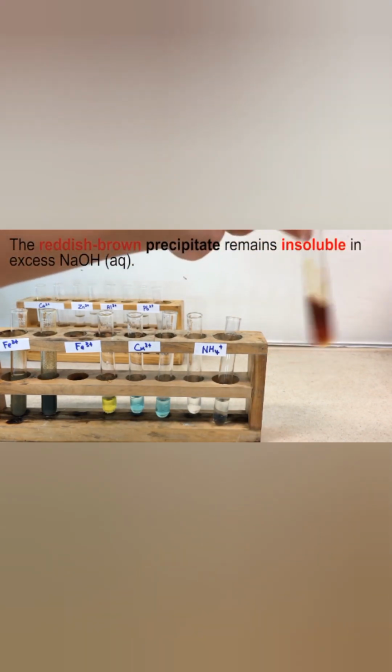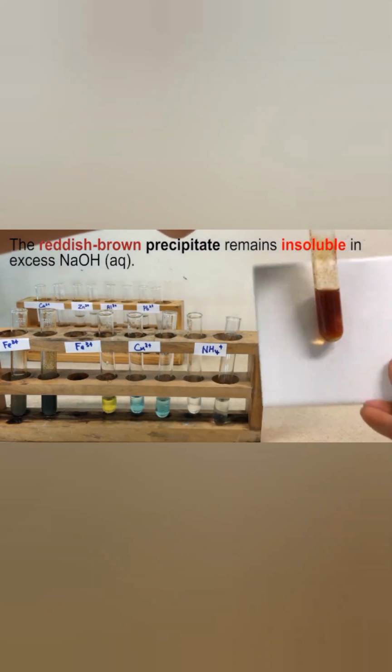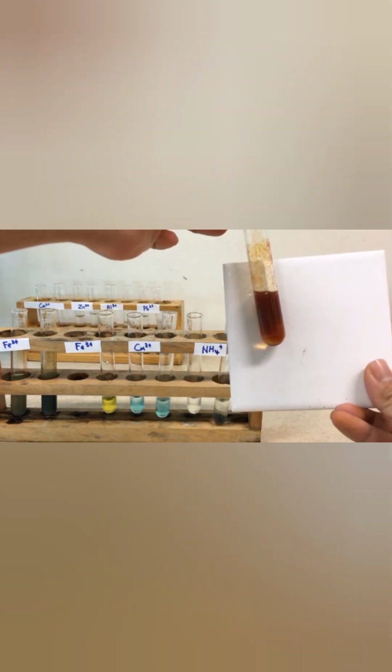Now, the reddish brown precipitate remains insoluble in excess sodium hydroxide. It remains insoluble.